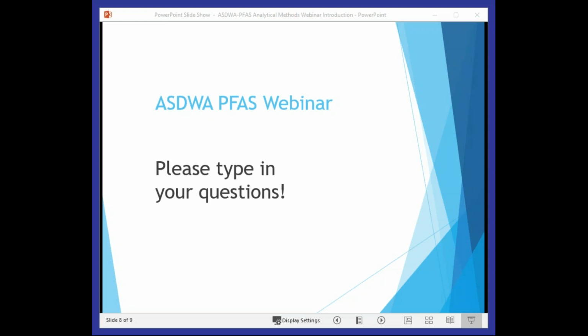All right, and let's see. We have another question: what's the purpose of forcing through origin in calibration for method 537? This is Chris, and again, I can contact Jody Shoemaker, the developer of that method, and provide an answer for that. Yeah, I'm not going to answer to the purpose. I just mentioned that it's there. Okay, no problem. Thank you. We'll follow up on that one as well. And I don't know if we have any other questions at this time.